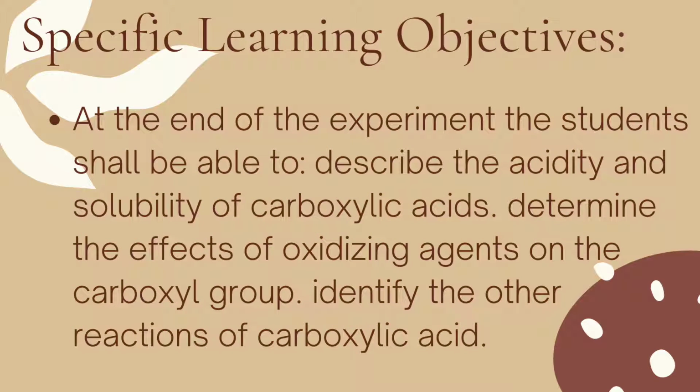Specific learning objectives. At the end of the experiment, the students shall be able to describe the acidity and solubility of carboxylic acids, determine the effects of oxidizing agents on the carboxyl group, and identify the other reactions of carboxylic acid.